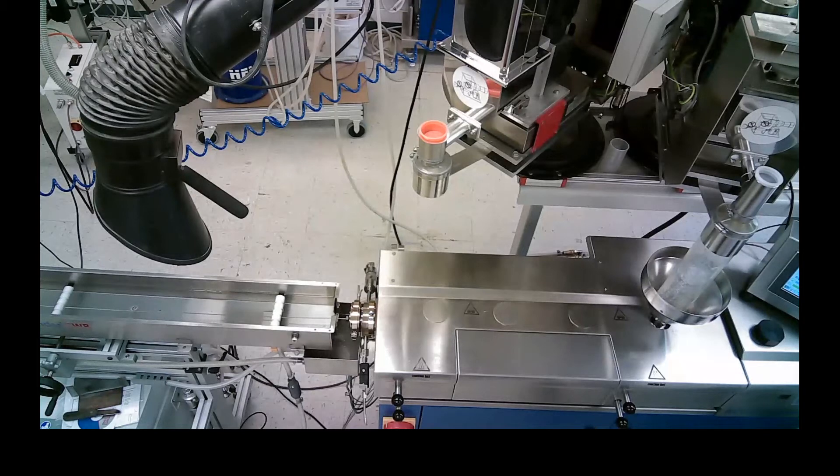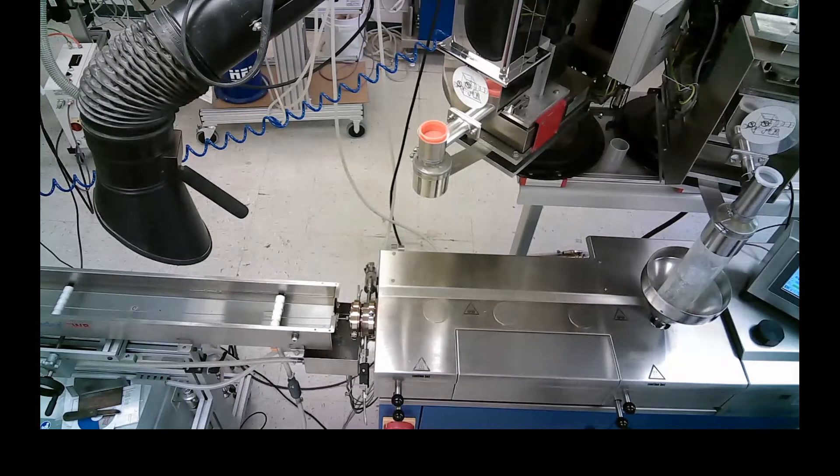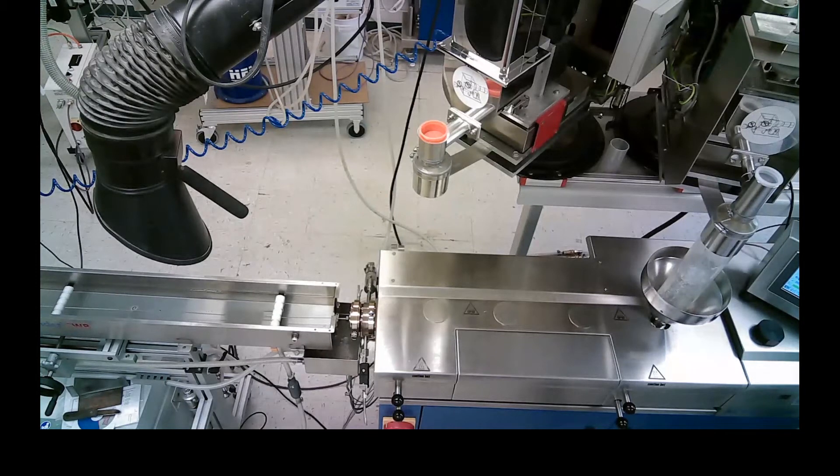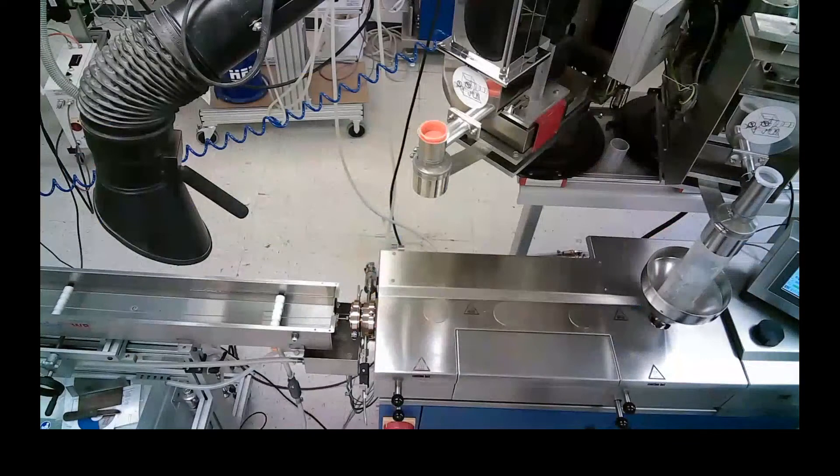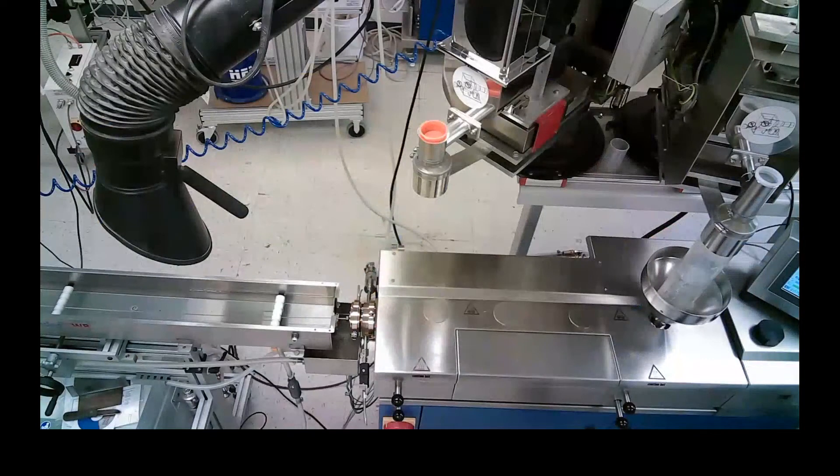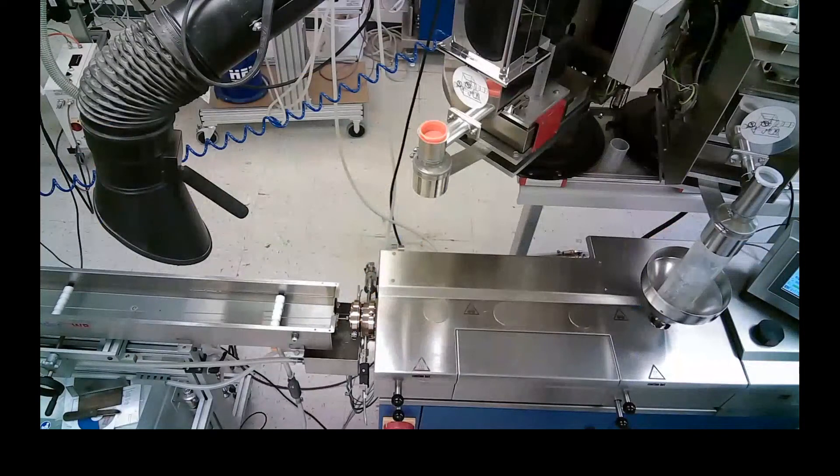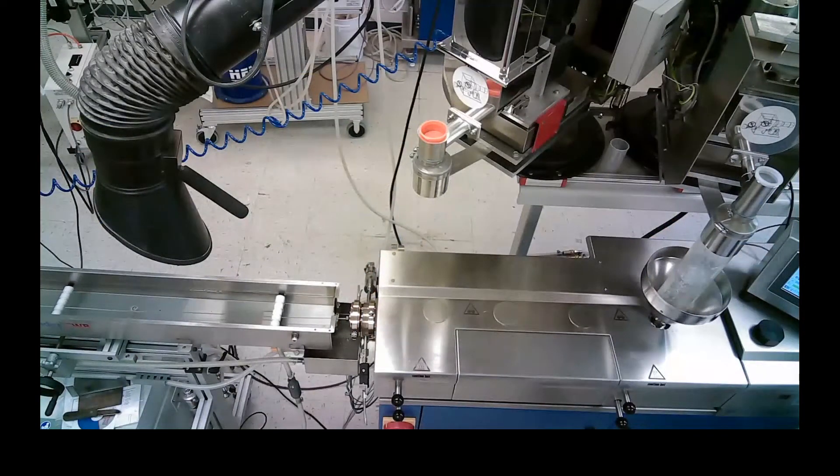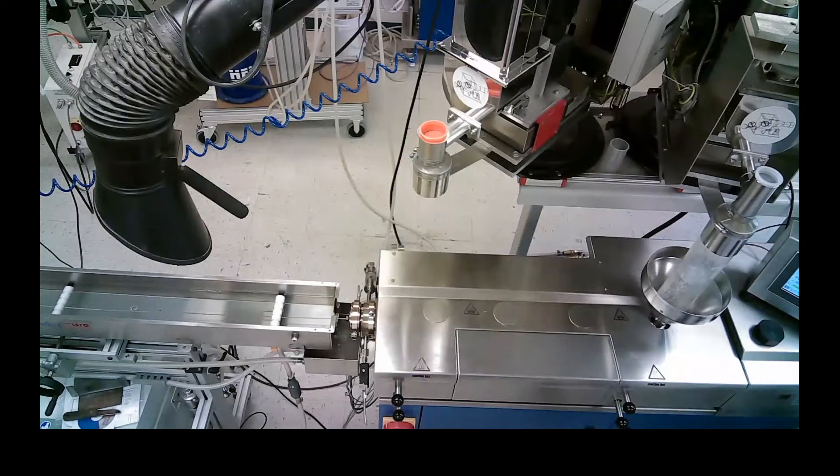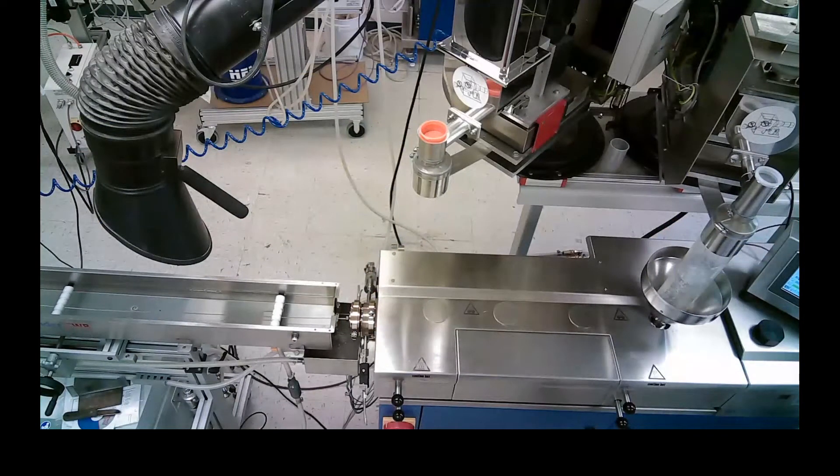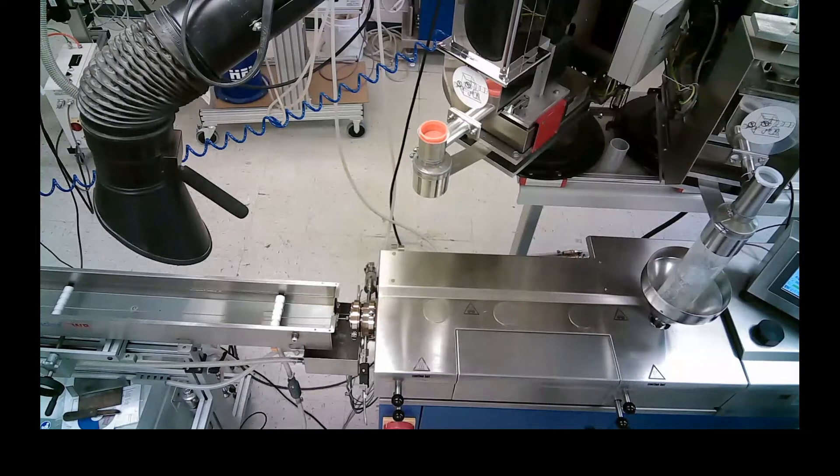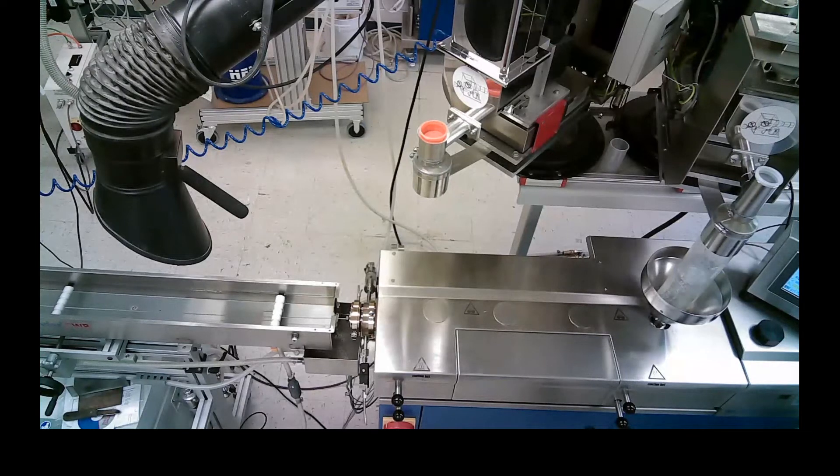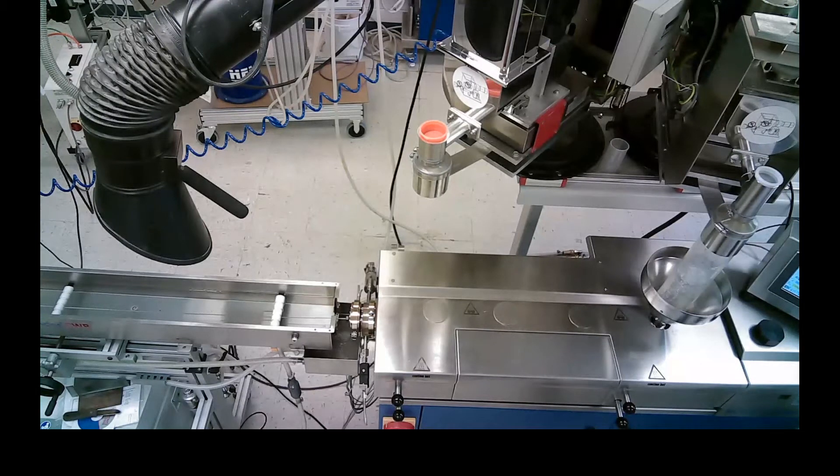Here in the setup we use a loss in weight single screw feeder from our sister company Brabender Technologies. It's also integrated into our entire software suite where you have complete report and controllability on your fingertips.